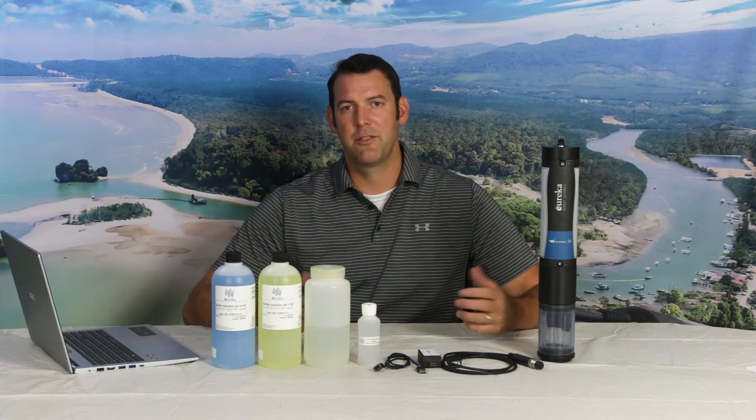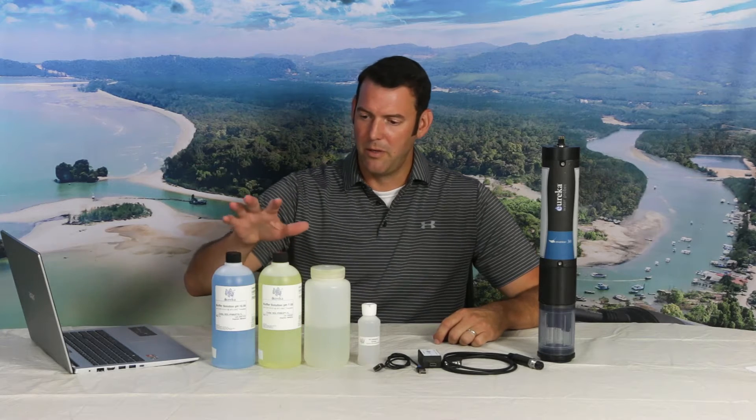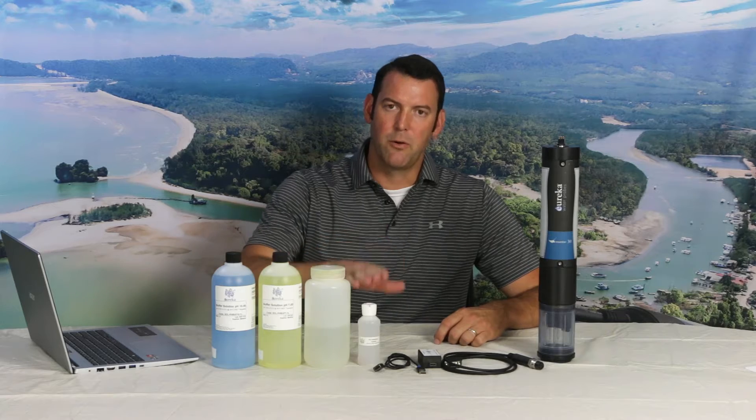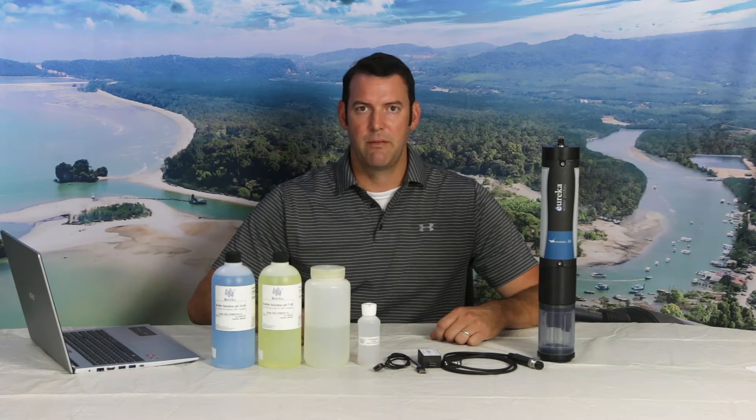Hello everyone, welcome back to another Eureka Water Probes instructional video. Today we're going to talk about calibrating your pH sensor. It's pretty simple really. All you need are two of your favorite pH buffer solutions, some DI water, your reference electrode electrolyte. Let's jump in.